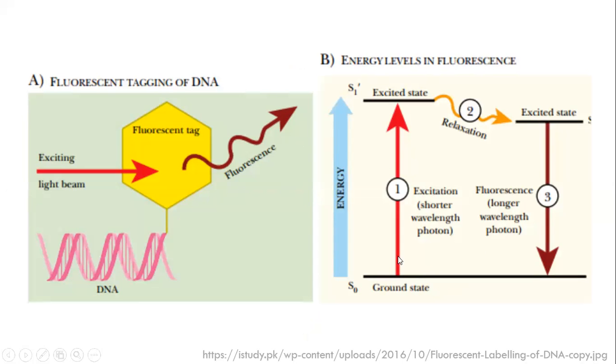And the basis of recognition goes through energy, ground state to excited state, energy comes up, then shorter wavelength, relaxation, the fluorophore and the tagged molecule can go into that de-excitation. This change in wavelength can be captured by a light that gives a specific fluorescent signal corresponding to the tag or wavelength of the tag we attach to it.